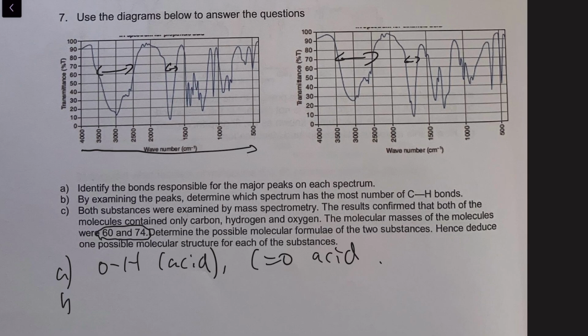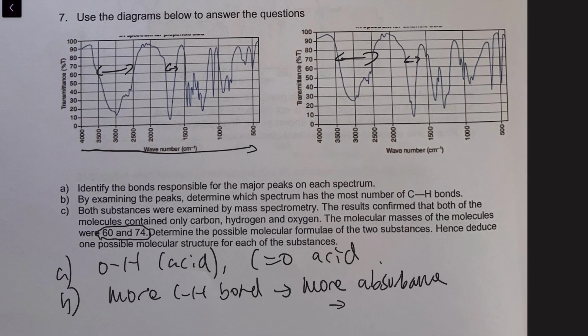And question B is the interesting one. By examining the peaks, determine which spectrum has the most number of C-H bonds. So how do we do question B? As I have already discussed in the earlier part of this video, if you have more C-H bonds, you have more absorbance. Thus, you have less transmittance.